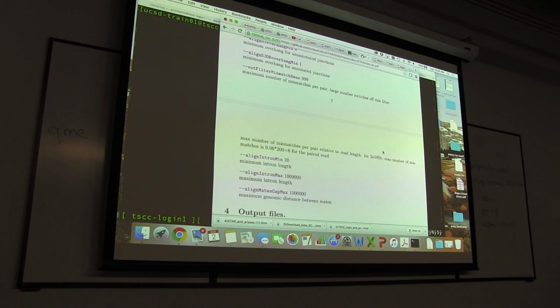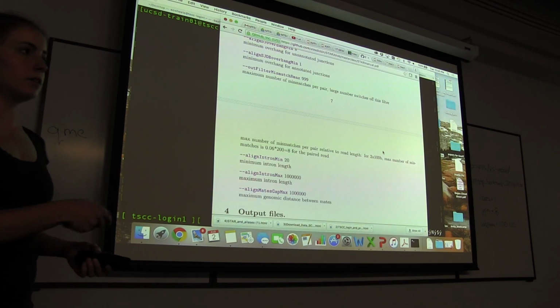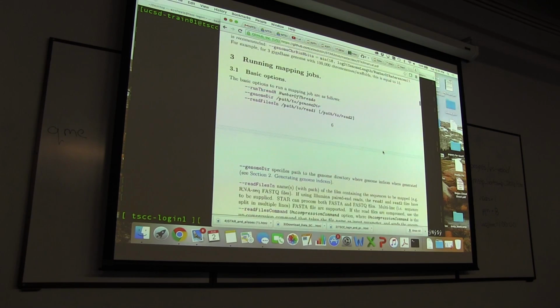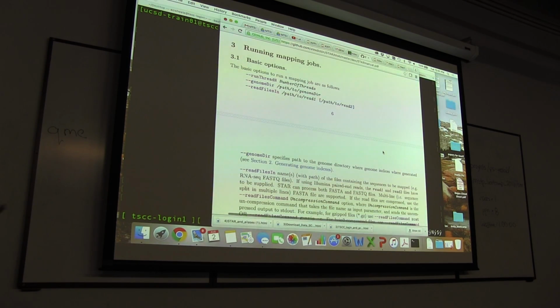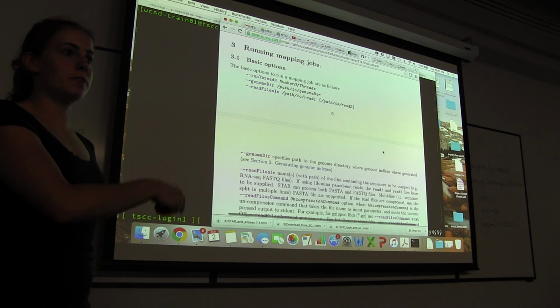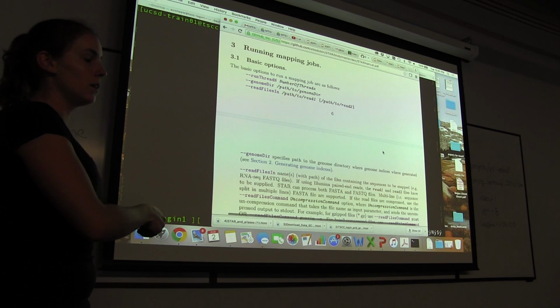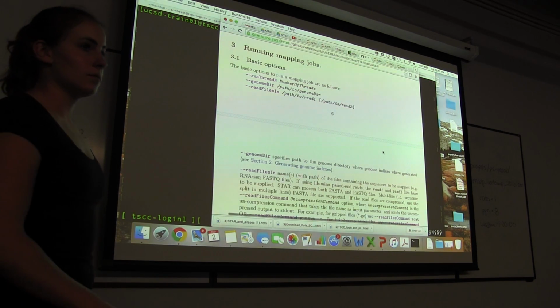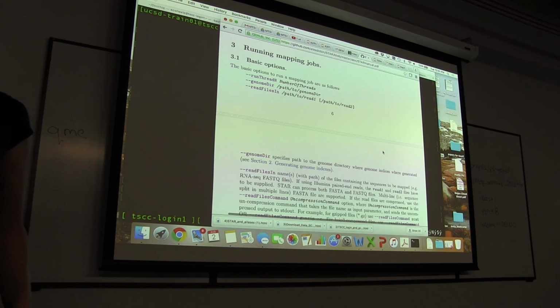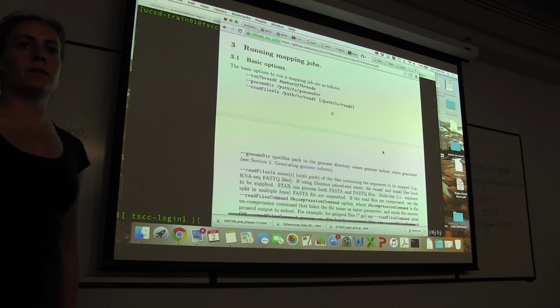You can write them down on a piece of paper, or you can write them in a text file if you want, but work with the people around you to essentially build your STAR command for mapping. And why don't you spend the next 5 minutes doing that, and then we'll go over the final flags that we decided on as a class together to make the final script. And like I said, avoid cheating by looking at that document. I mean, you can if you want, but what fun is that? And make sure you talk to the people around you, help each other out.